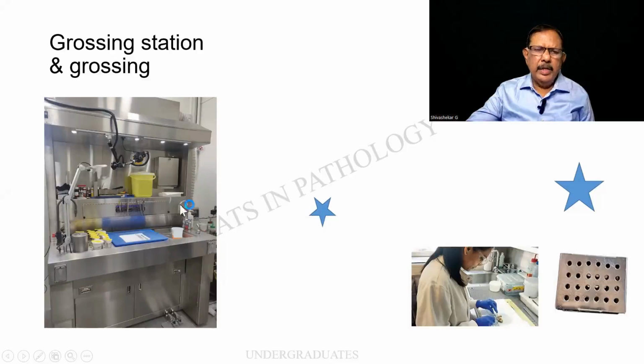And finally, unwanted specimen will be discarded or put back into the bucket, and the necessary ones alone. Look at what this technician or pathologist resident is doing. So they are meticulously processing the important tissue and putting it into a capsule. This is called a tissue capsule. As I told you, count the stars.